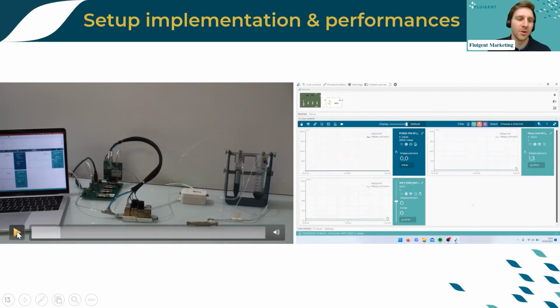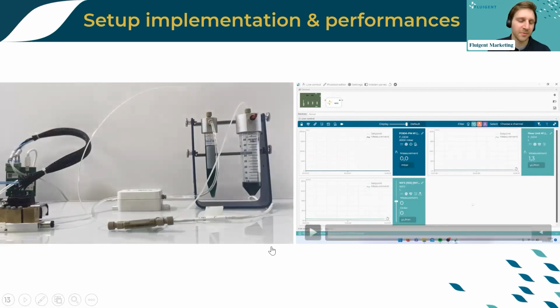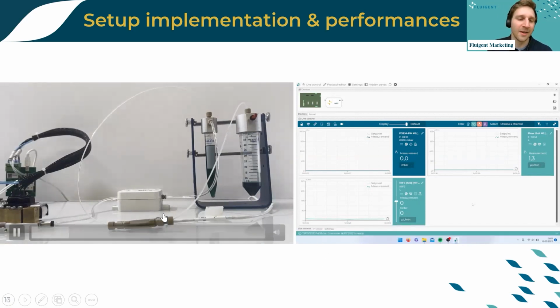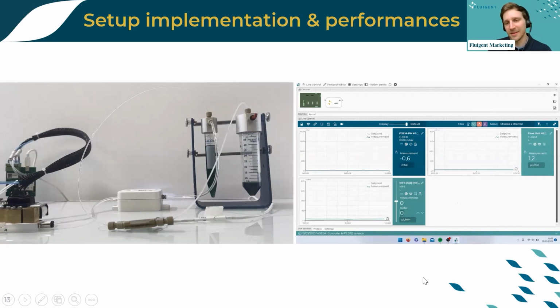But this is just to make the comparison, to make sure that you understand that we have the same flow rates, even if it's maybe not very intuitive that measuring the gas flow rates is completely equal to the liquid flow rates. And so this is our interface. Here we will directly go to the right flow rate because we already made a learning phase here. But this is how the system will behave in general.